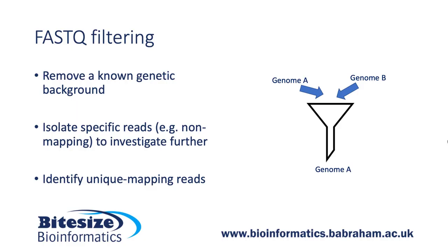So far we have been talking about FastQ Screen as primarily a QC tool. That is, to judge the quality of FastQ files that you pass to it. However, with time, we developed some extra functionality for the tool. That specifically is the ability to filter FastQ files.